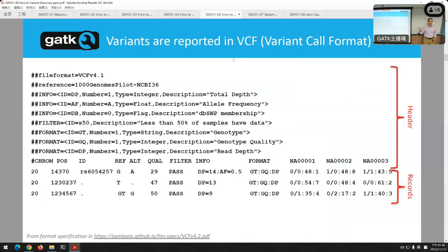It was from those days when we had very few samples, so it doesn't really scale anymore, and we're trying to update it. In the early days, we had a few thousand samples in the world, and now we have millions. It's hard to represent millions in this format, but we'll do it for now anyway today. But the important piece is the bottom section, where you start to list all the mutations. Going through the fourth to last line, that's the last header line, and then you actually have data.